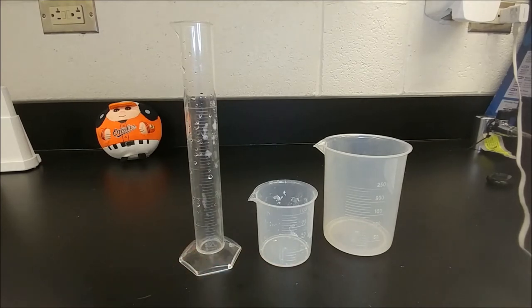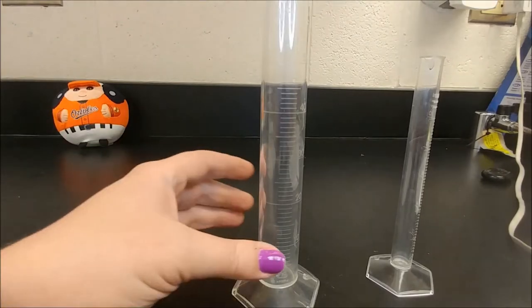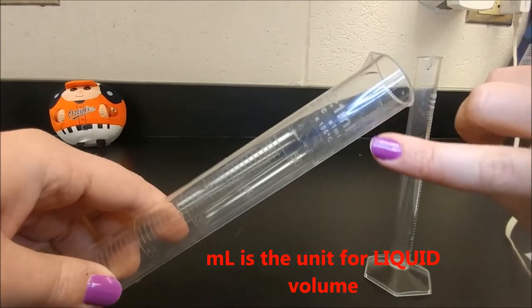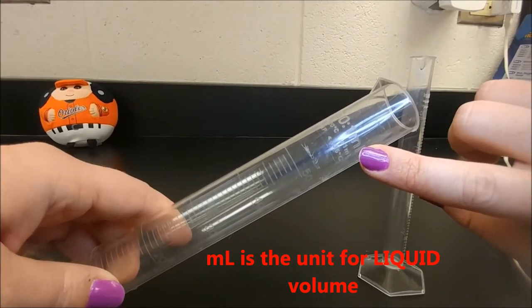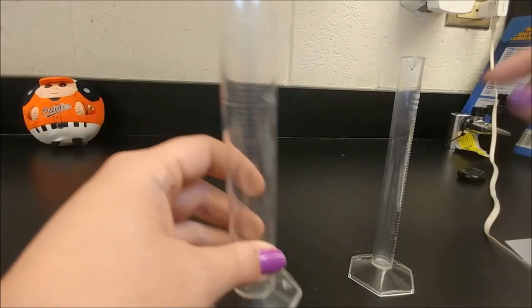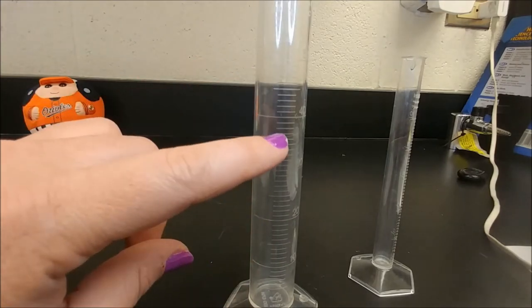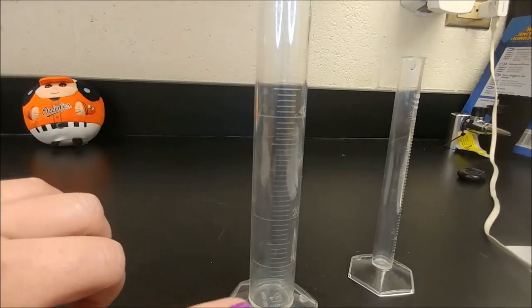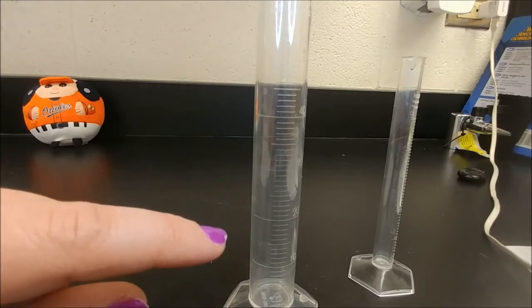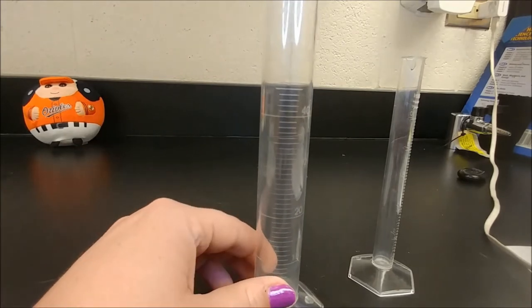Let's take a closer look at the graduated cylinder. This graduated cylinder is measured in milliliters. If you look up here at the top, you can see that it says it's measured in milliliters right here. Most tools will have the unit listed on them. Each little line indicates how many milliliters this graduated cylinder can hold — they're also known as graduations. There are some lines marked with numbers and some that are unmarked.